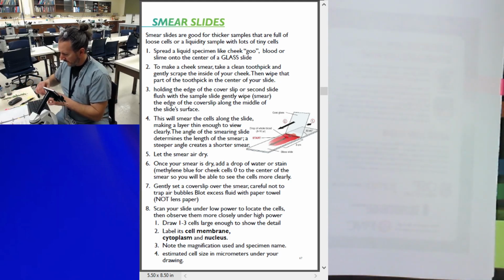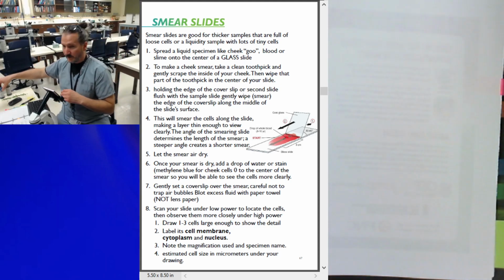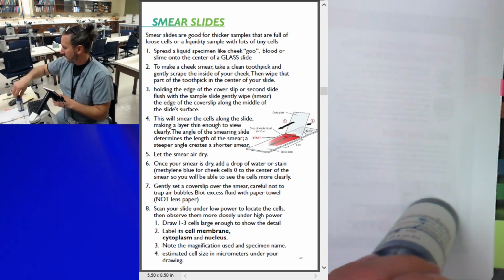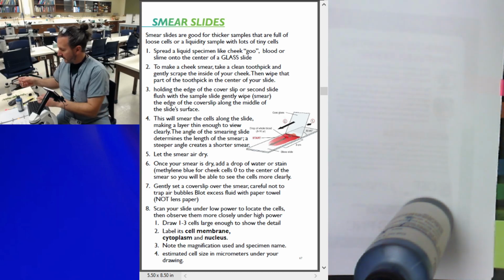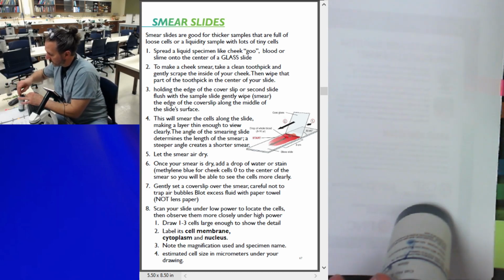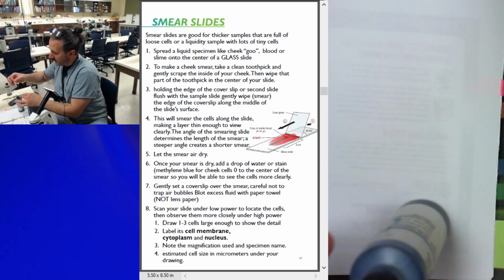All right. What I'm going to do is I'm going to take my methylene blue, right here. I'm not going to use the same toothpick. I don't want to contaminate my methylene blue. Take a little bit.